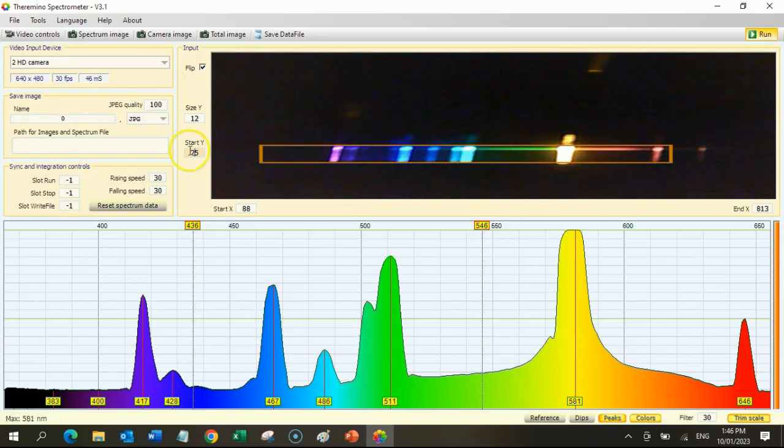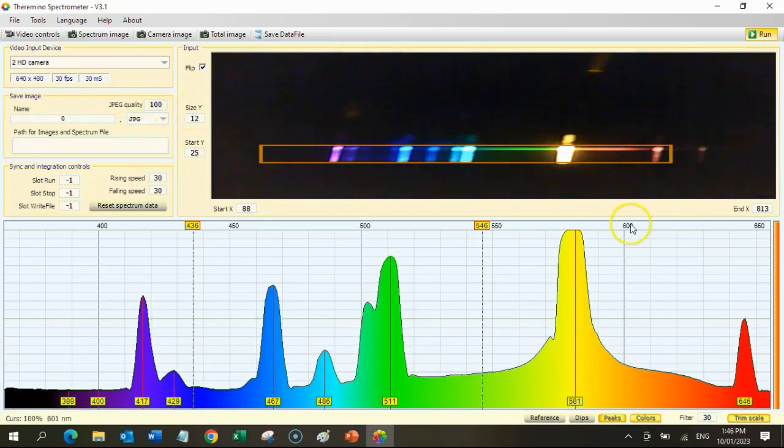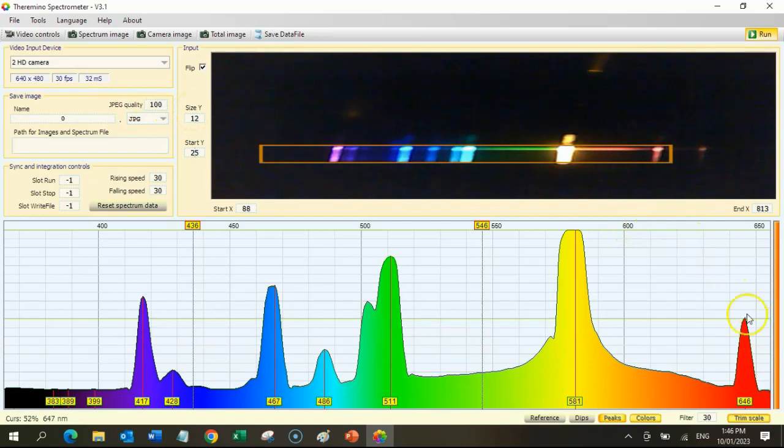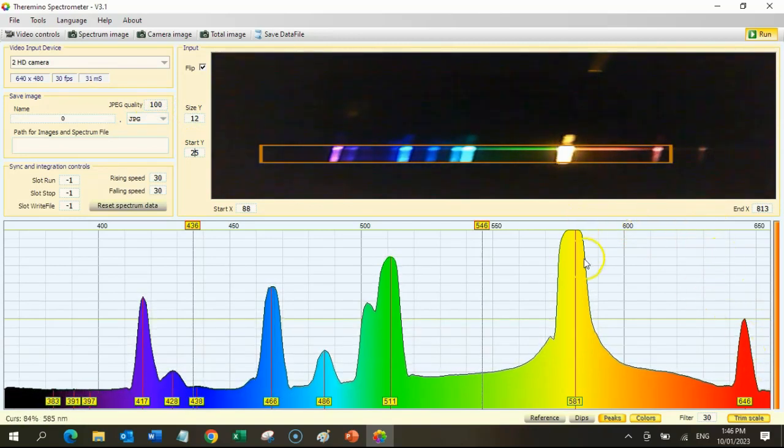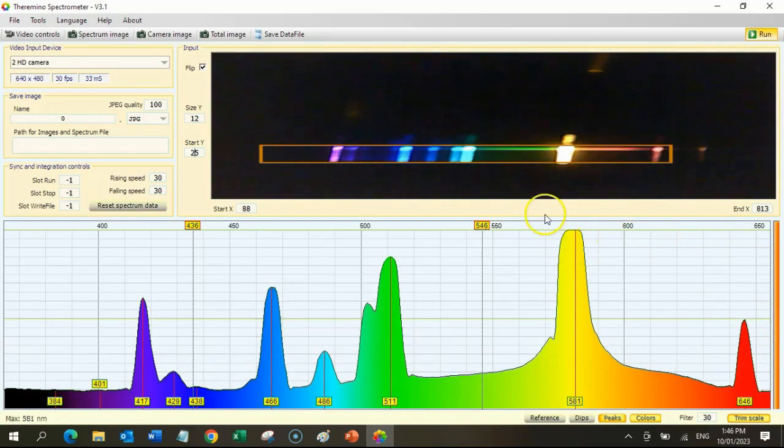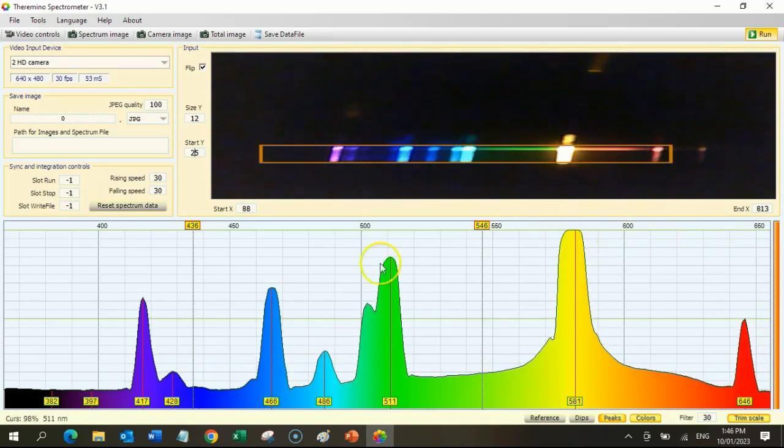Light coming from a lamp might look like this. Here the screen is being adjusted for the spectrum of an element. You should be able to identify the elements from the peaks or the high points in the spectrum.